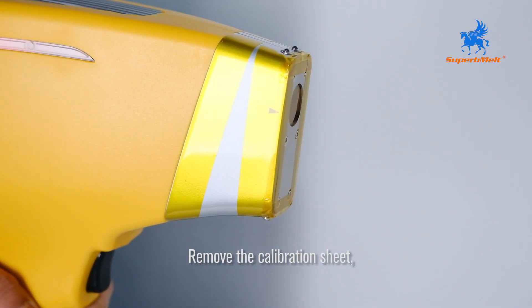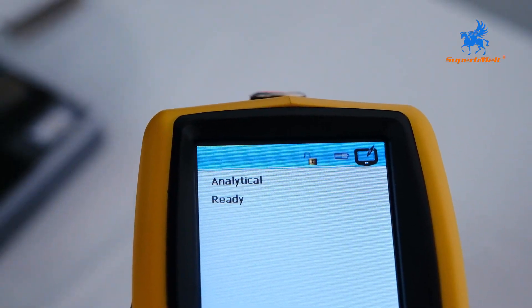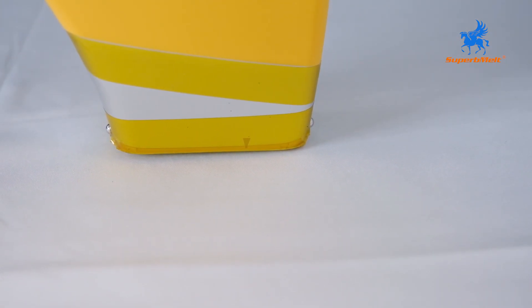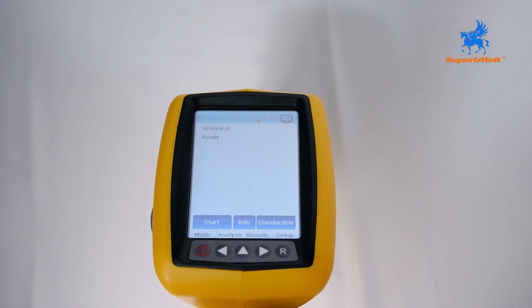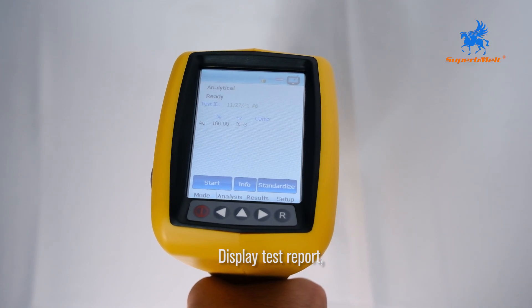Remove the calibration sheet and click start. Place the sample flat on the table. Pull the trigger lightly and wait for the red light to stop flashing — about 15 seconds. The display will then show the test report.